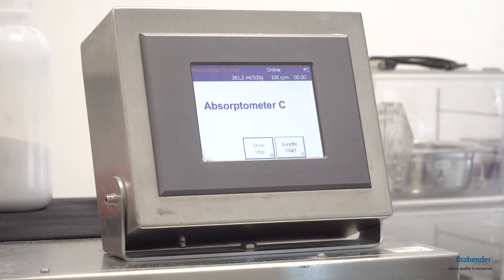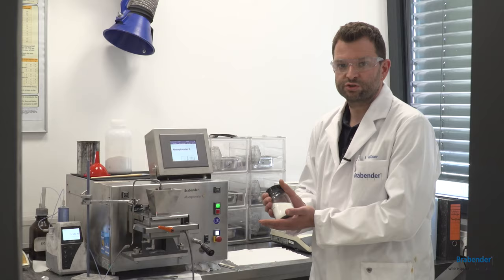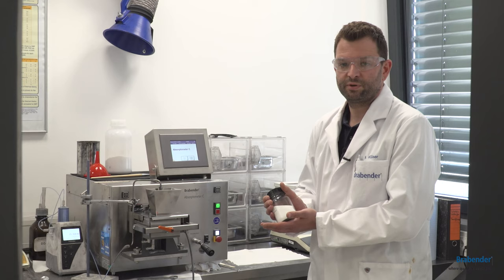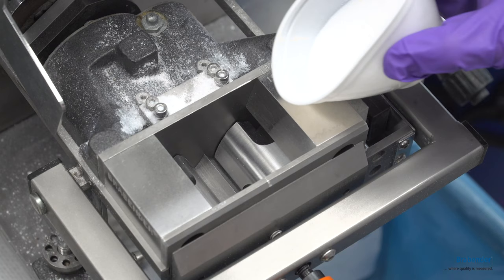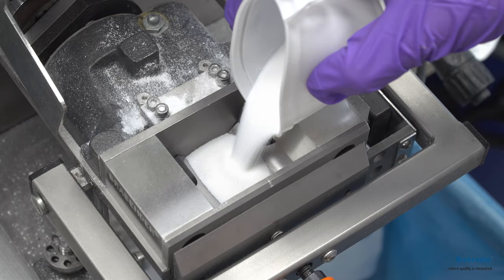With the Absorptometer C we determine the oil absorption number. Today we test a type of silica material. It's also possible to test other materials.